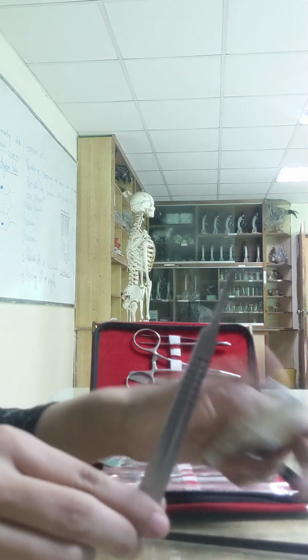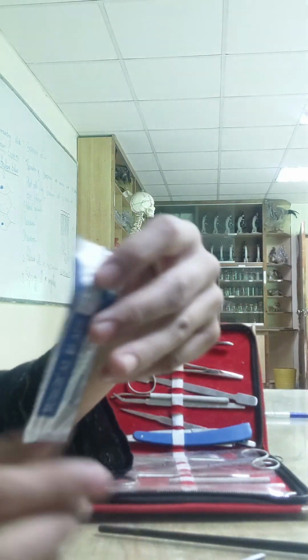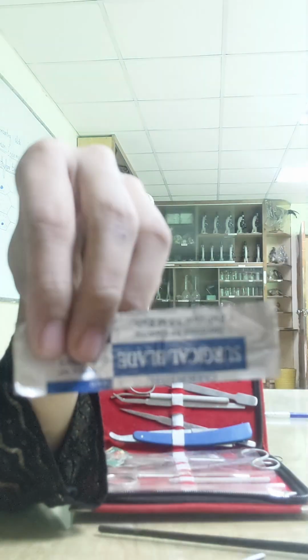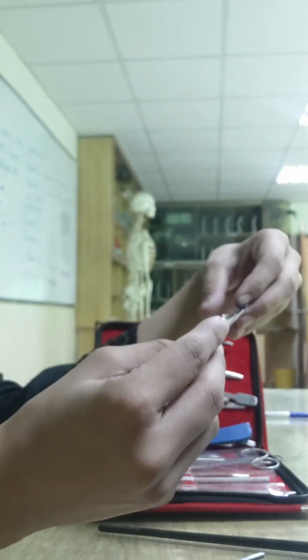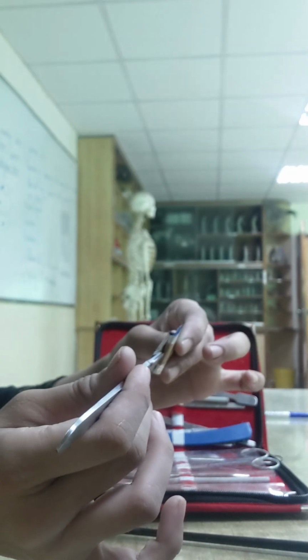The first tool we will study is the scalpel. It's a very small and extremely sharp instrument. Actually, this is the stand of the scalpel, and a blade should be added on the top. How can we add the blade? This is the blade, the surgical blade. It comes in different numbers, 10, 11, 15, and each number has its specific uses, and they are used to make precise and localized incisions or blade cuts in surgery.